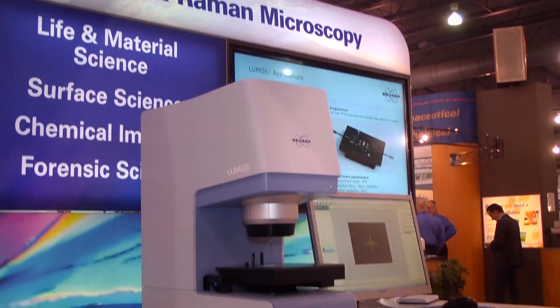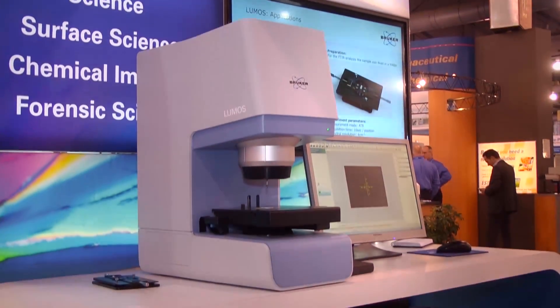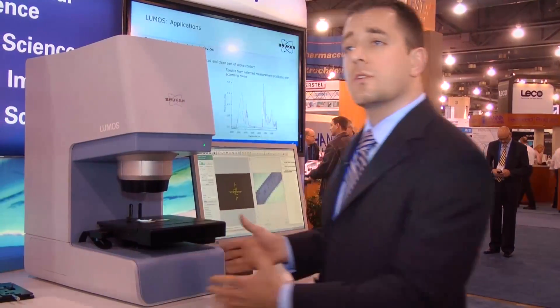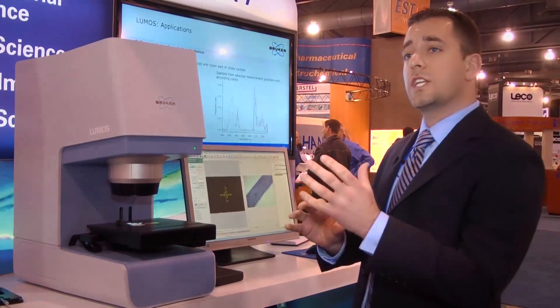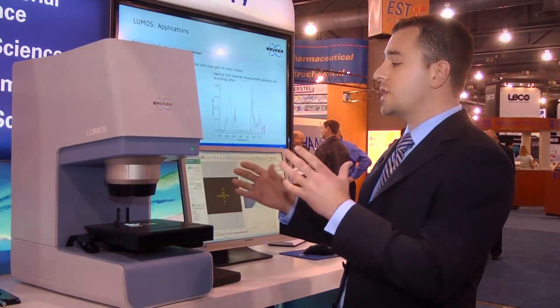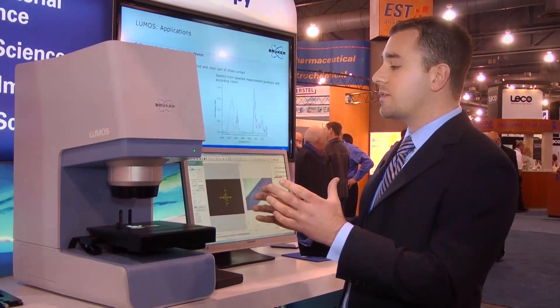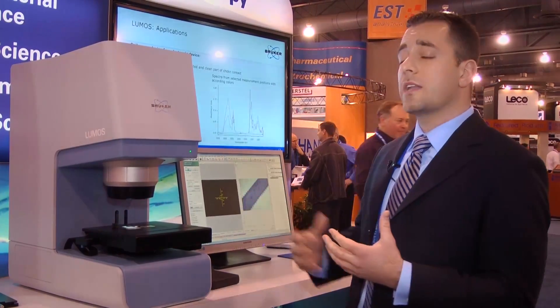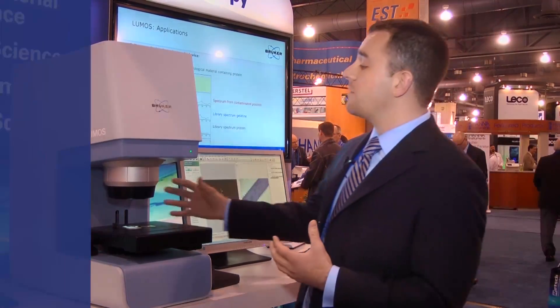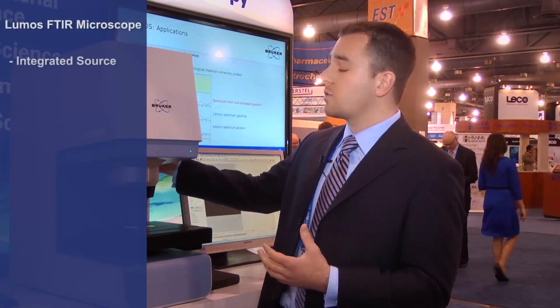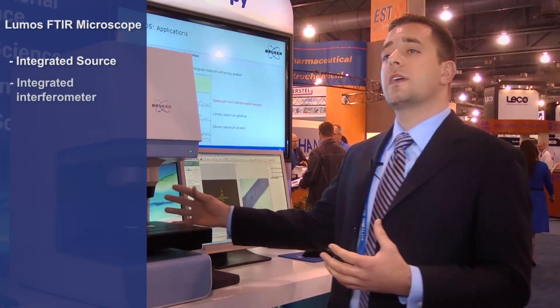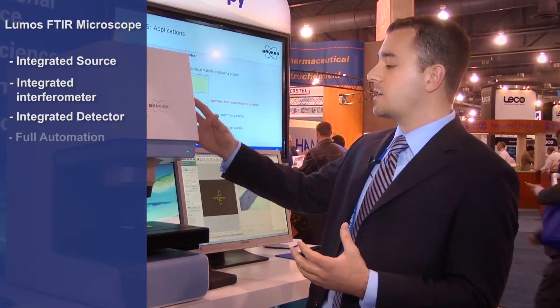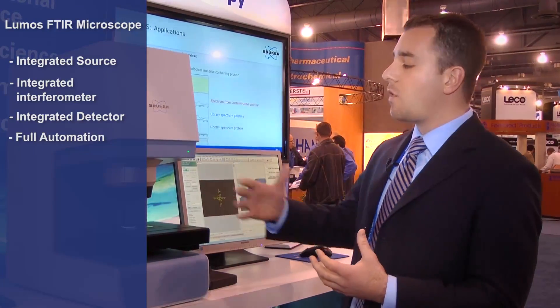The system is a completely self-contained unit. As you can see, there are no knobs, no devices to change any apertures, change objectives, or anything like that. It's a completely standalone system, so you have an integrated source, integrated interferometer, integrated detector, and full automation.